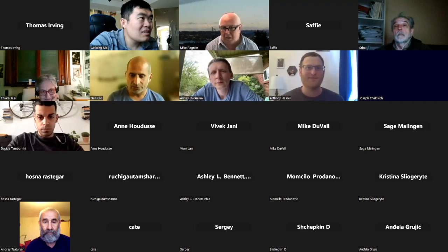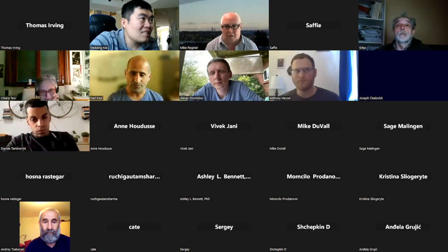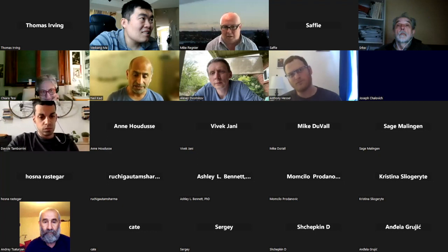We're limited by a number of factors there. The issue is that for each sarcomere, we're only collecting a couple of events. If there's sarcomere to sarcomere variability, which there will be along the myofibril, and we're trying to assign any kind of sarcomere length dependence to individual events within a sarcomere, we just don't have enough data. Over a 30-minute recording, we'll get around 200 ATPs, so we have to record for hours and hours and hours. What we do is refresh myofibrils regularly to keep them as fresh as possible. We then take all of those data, put them together, and aggregate them.